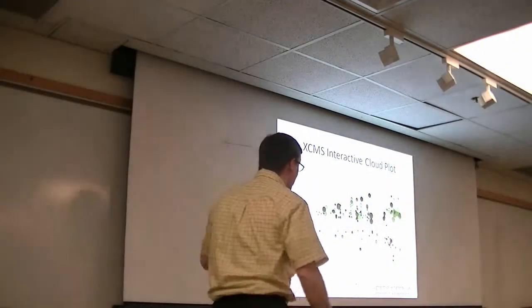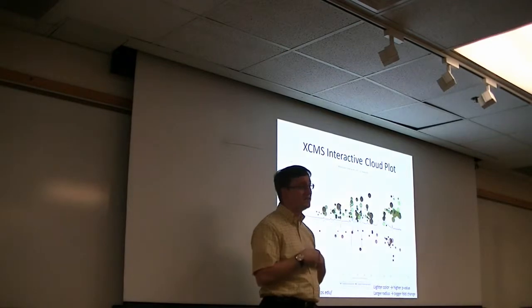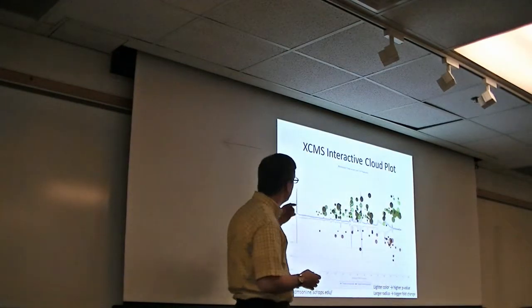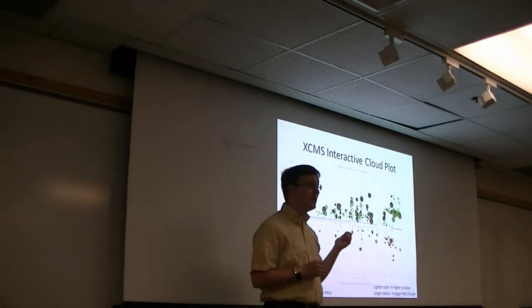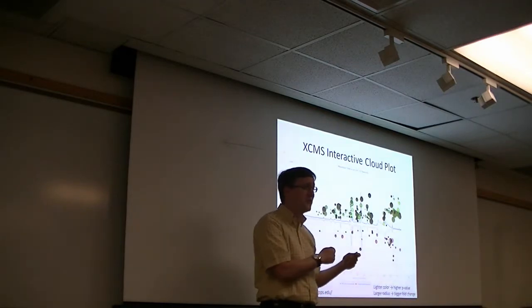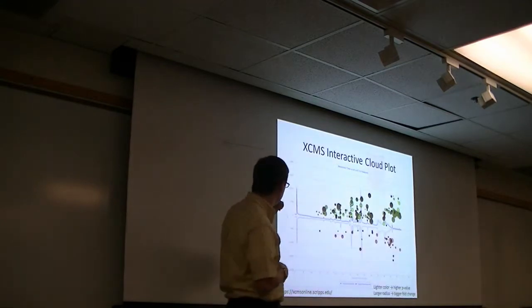All right. Now they've gone with some really novel ways to do the visualization. So not volcano plots, but rather these cloud plots on the XCMS interactive site. And I would note that looking at these on the website itself is quite valuable because you can see just how much information becomes accessible to you this way. They're much more interesting to look at in that light.